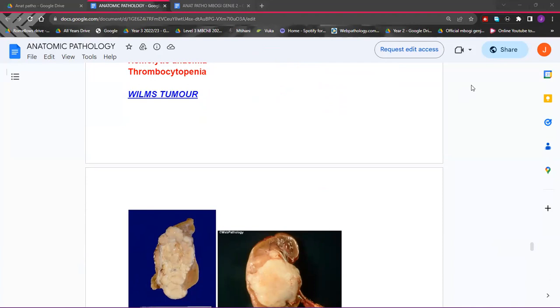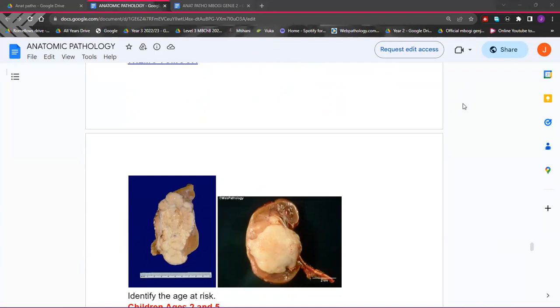Here we have a malignancy. Maybe we can describe the gross morphological features. A solitary nodule with tan yellow appearance. Tan yellow, I would call it probably grayish whitish. It's bulging. Exactly. What else can we see? So I think we mentioned large, right? No, so it's also large. Yes, someone mentions well circumscribed. I agree. Now, what else?